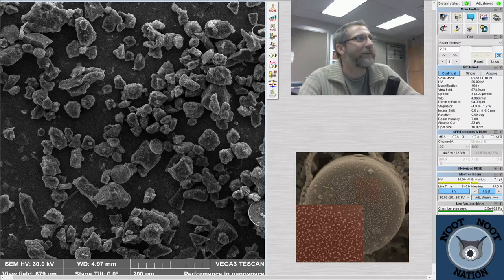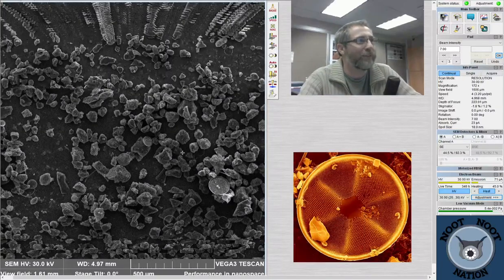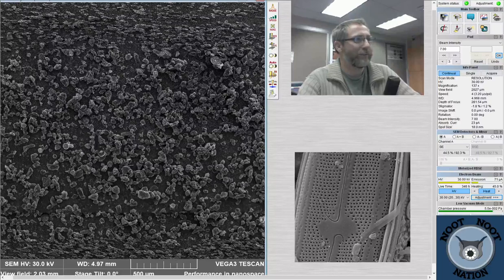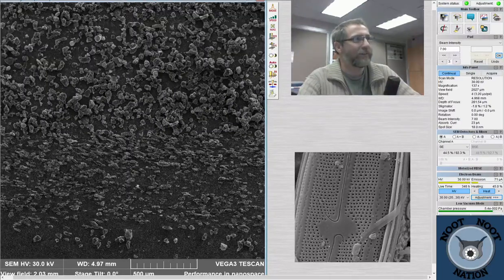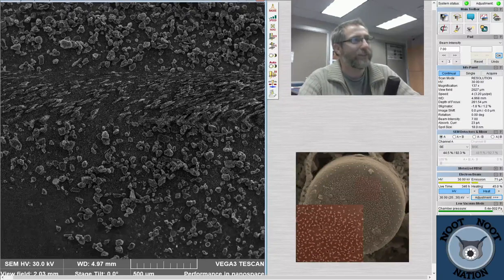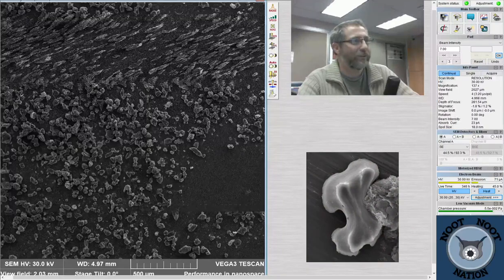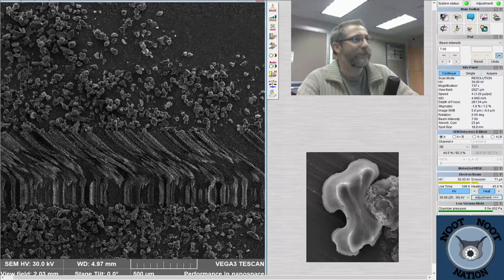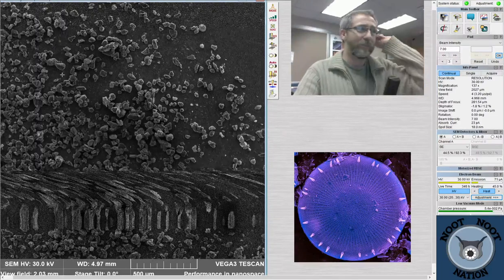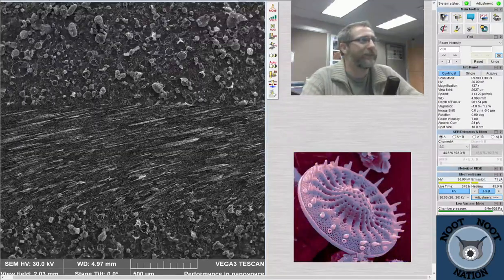This one's mostly rocks. It's like the top of the sample versus the bottom of the sample when I put it in a pipette and pipetted it in. So you can see all the diatoms got trapped in a different sample and all the junk got in this one. There's positives and negatives to that. They kind of settled out first. It probably means there's not a lot of clay in this one. You can see the samples are pretty clean. The diatoms are pretty clean when I move around on the slide, but it's mostly chunks of debris. So we can skip this one, but maybe the next one over will have more diatoms and less clay.